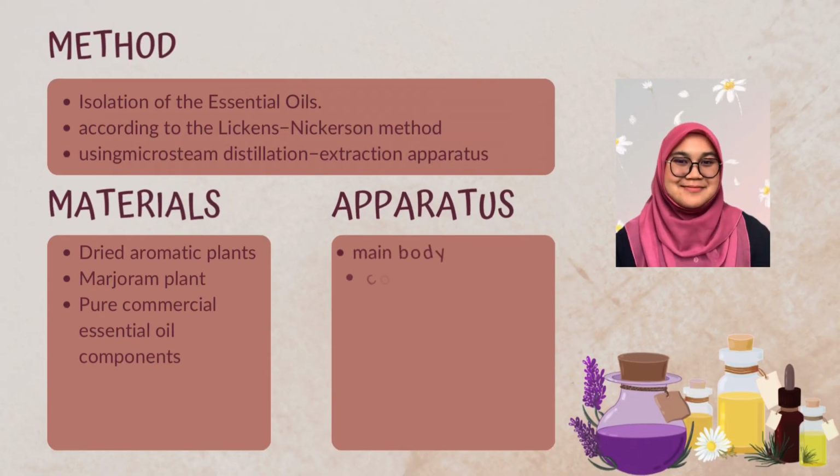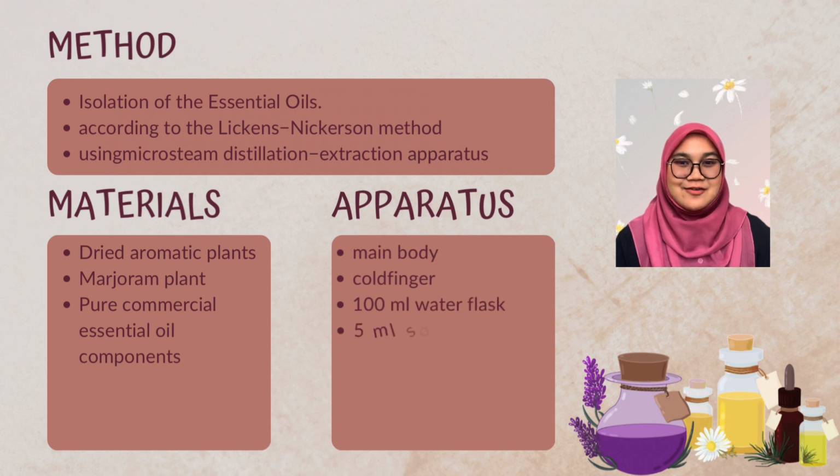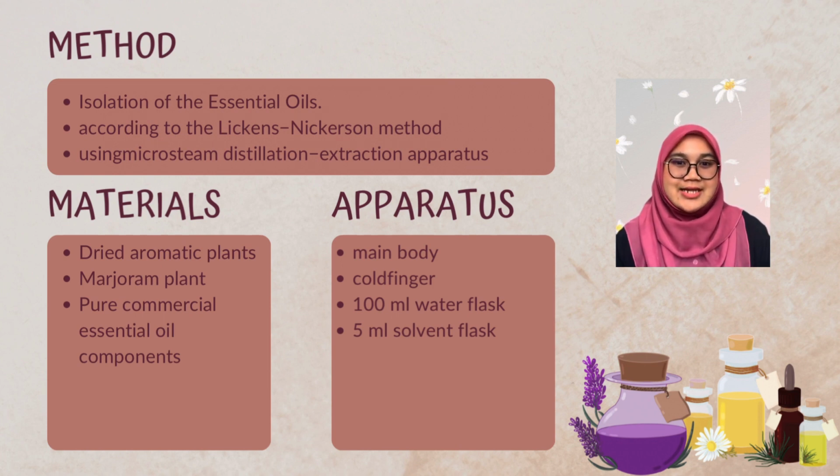I will present the methodology and sample preparation of essential oil. The method that we will use in this analysis is isolation of the essential oils. The essential oils were isolated according to the Likens-Nickerson method, using a microsteam distillation, which is the extraction apparatus for organic solvents lighter than water.